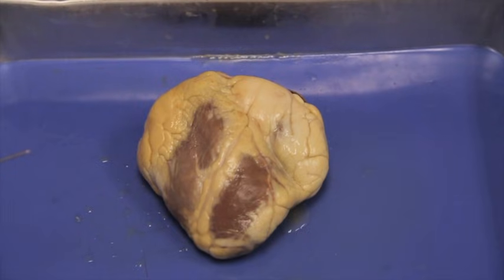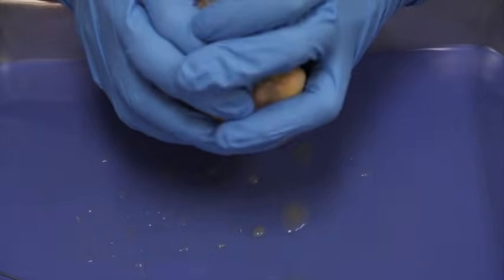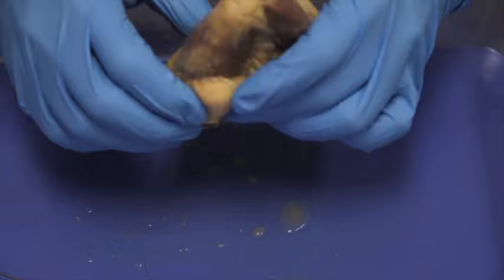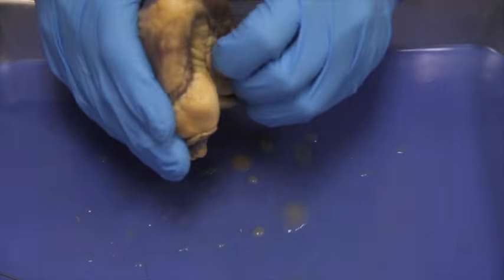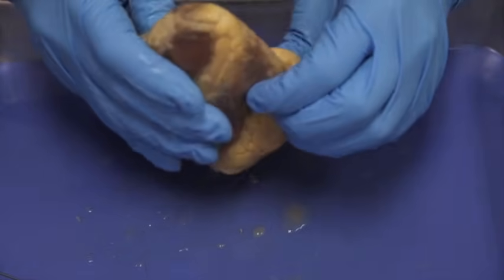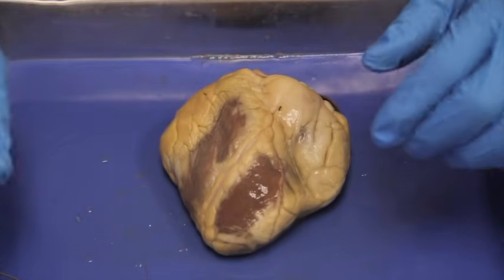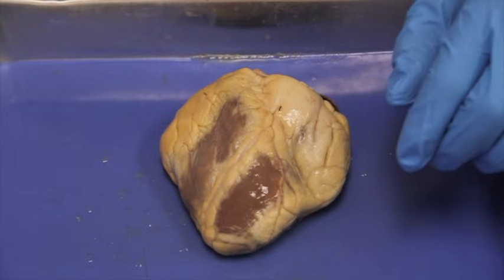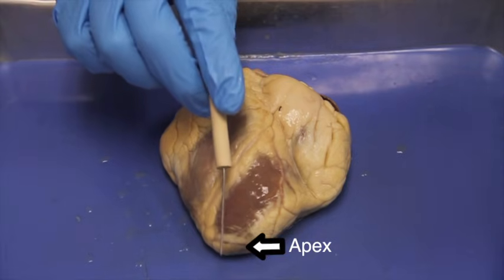Let's identify some external features of the heart before we begin cutting, so we know where to cut the heart correctly. First, let's massage the heart with the vessels pointing down to see the proper gestalt or shape of the heart, massaging the lateral sides all the way around. Notice the juice that comes out — point it always down so it doesn't squirt in your eyes. The first external feature we're going to find is the apex. The apex is easy to find because it's pointed — this is the inferior end of the heart.